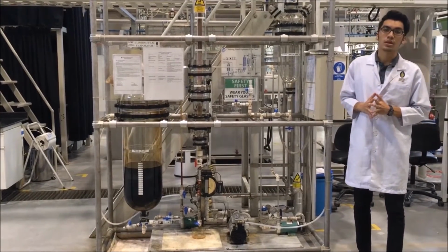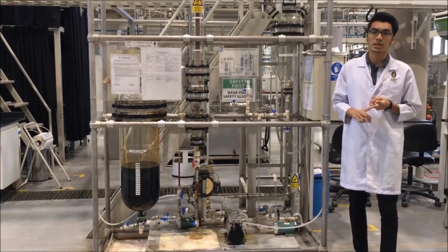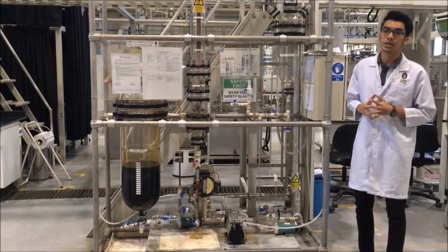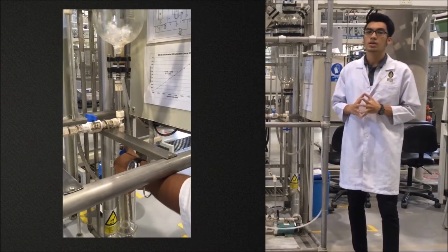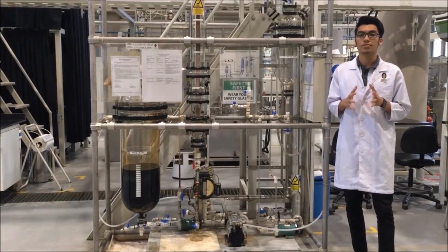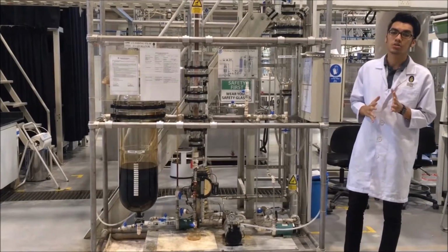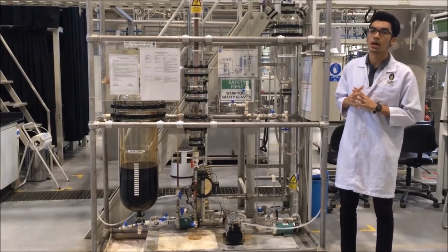After that, we need to take 3 samples, which are the evaporator sample, the condensate and the concentrate. The condensate can be taken directly from the receiver tank by using the valve B12. The concentrate sample is located in the upper tank.